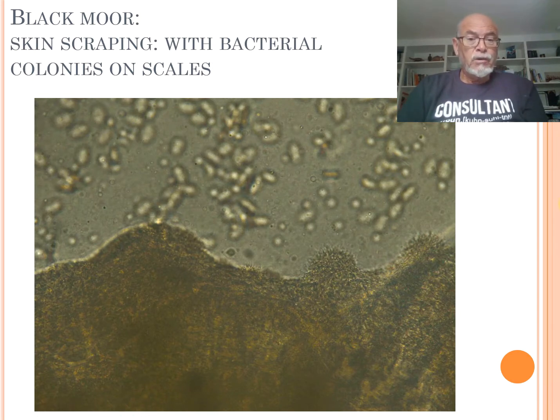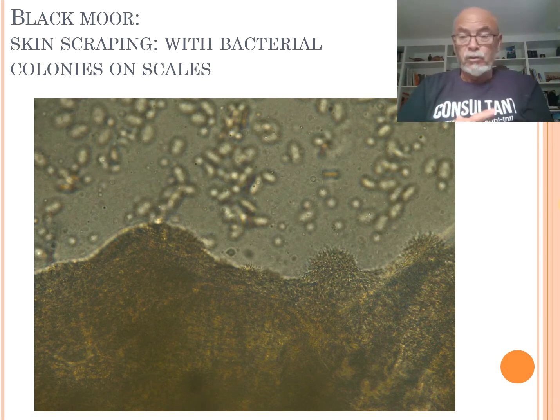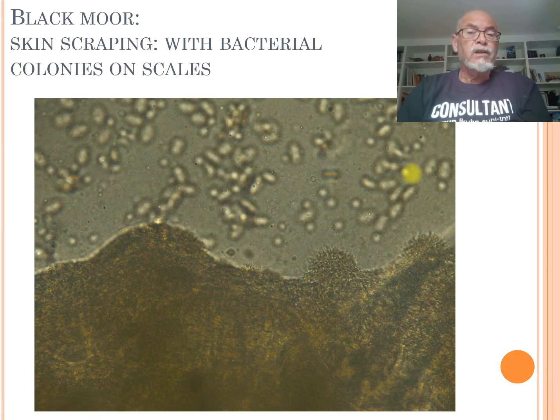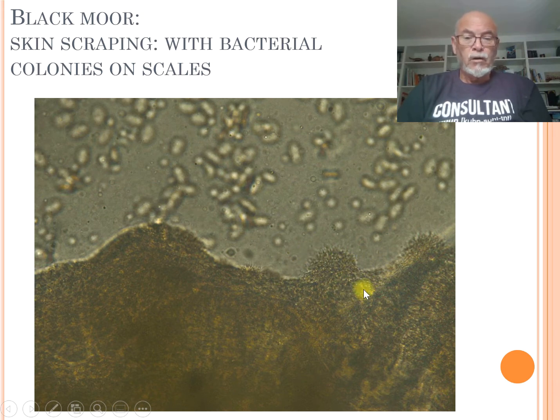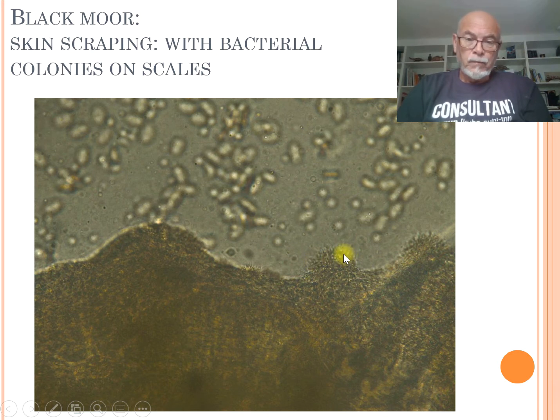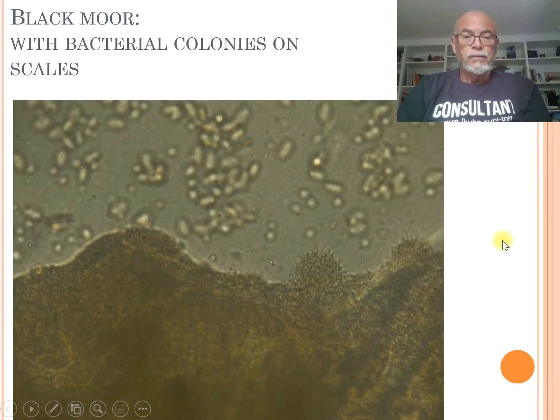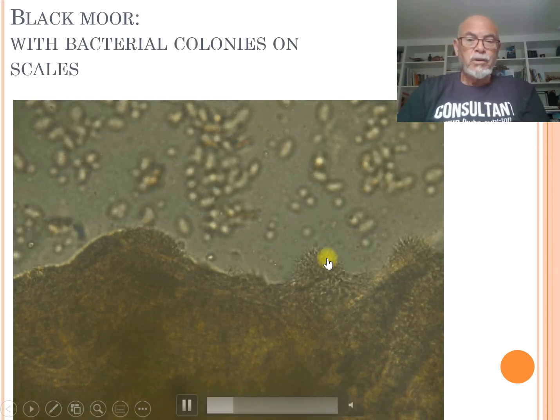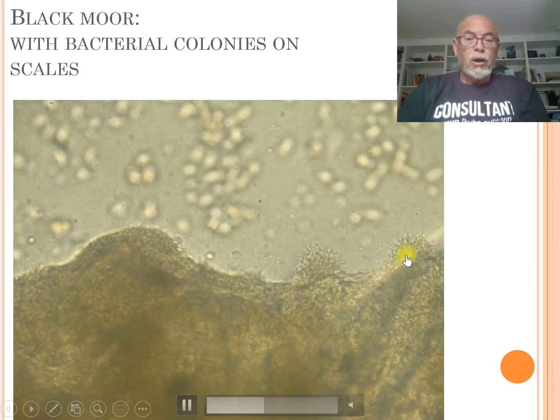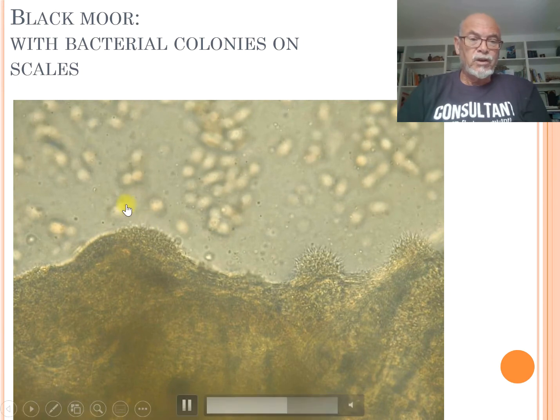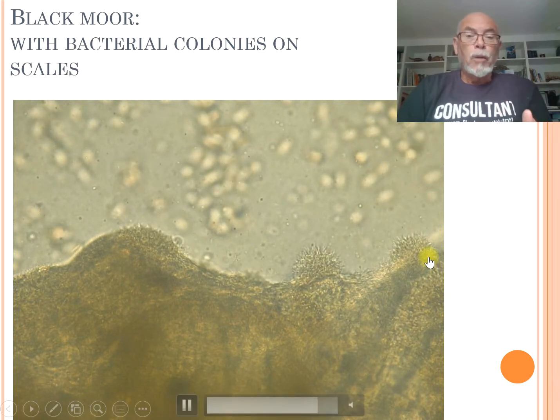What you should do is take a skin scraping. That skin scraping can help you determine what you can see, particularly with columnaris. In those microscopic observations, you can identify the bacteria due to its formation of colonies — these groups at the edges of the scale of the fish. Here is a group of bacteria. You can see very clearly, they form tubifex-like colonies. Here we see the video — you can see the bacteria moving like tubifex. You can see them here too. All colonies of columnaris bacteria.